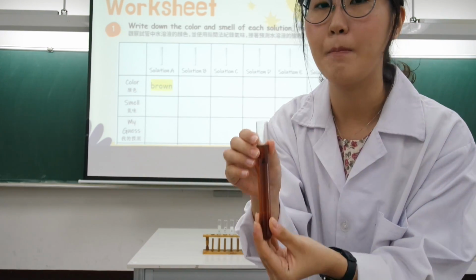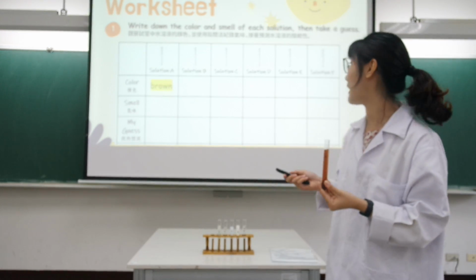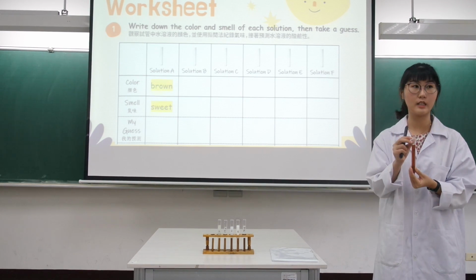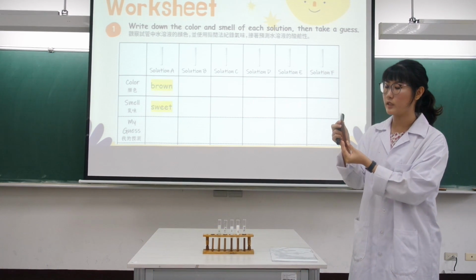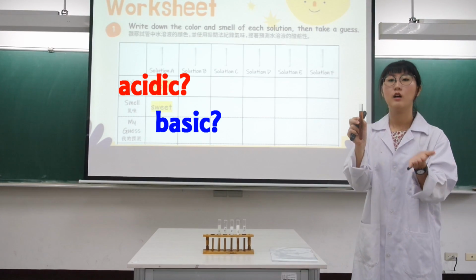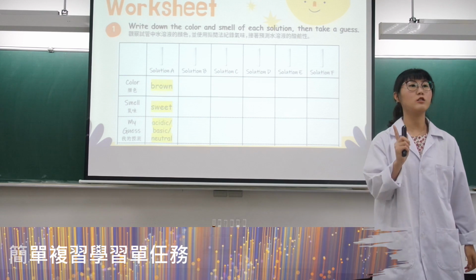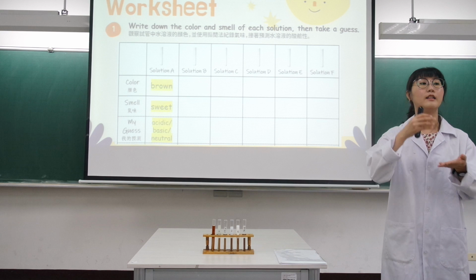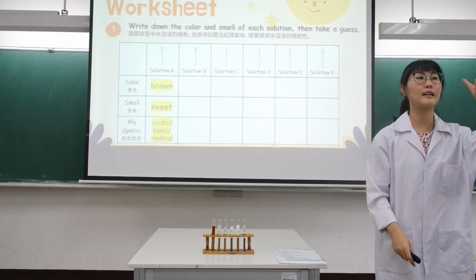Sweet. Very good. Ben said it smells sweet. Okay, so you need to write down sweet here. Solution A smells sweet. And I want you to take a guess. Take a guess to see if solution A is acidic, basic, or neutral. When you get your worksheet, remember I want you to write down the color of the solution and the smell of the solution. And I want you to take a guess.